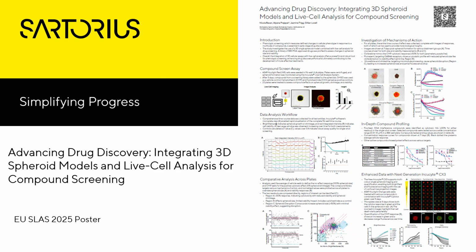Today I'll be discussing a poster which was previously presented at the Society for Laboratory Automation and Screening European Conference, an exhibition in Hamburg, Germany in May 2025, titled Advancing Drug Discovery: Integrating 3D Spheroid Models and Live Cell Analysis for Compound Screening.